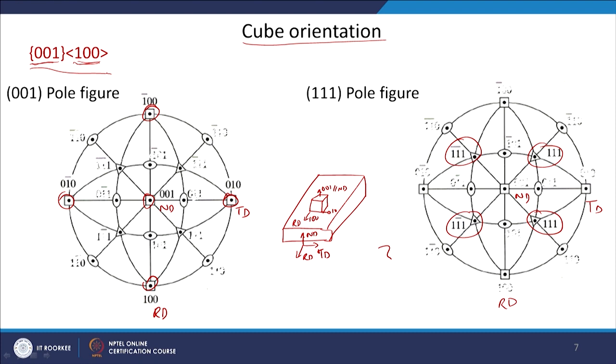And from understanding of stereographic projection, we know that where these poles will come. Where these four poles will be coming, the symmetry will be there. And what will be the angular information, you can always get using the Wolf net, and that will follow whatever is the angle which you have calculated using, for example, cos theta relationship.